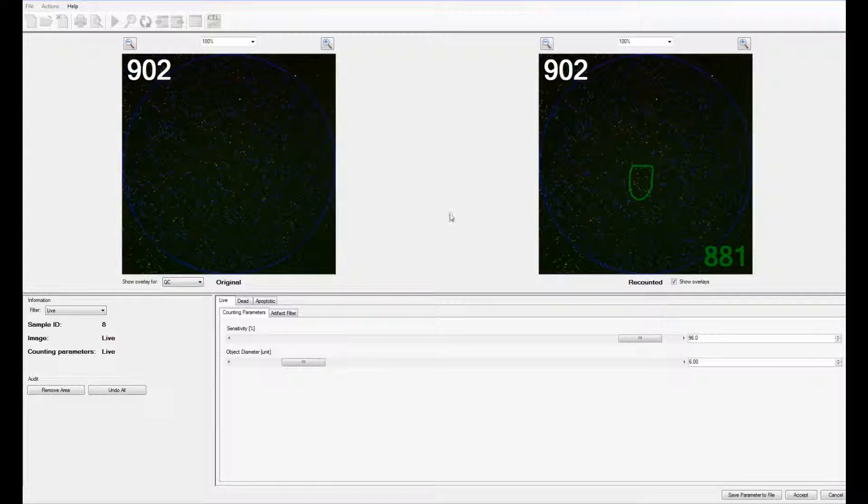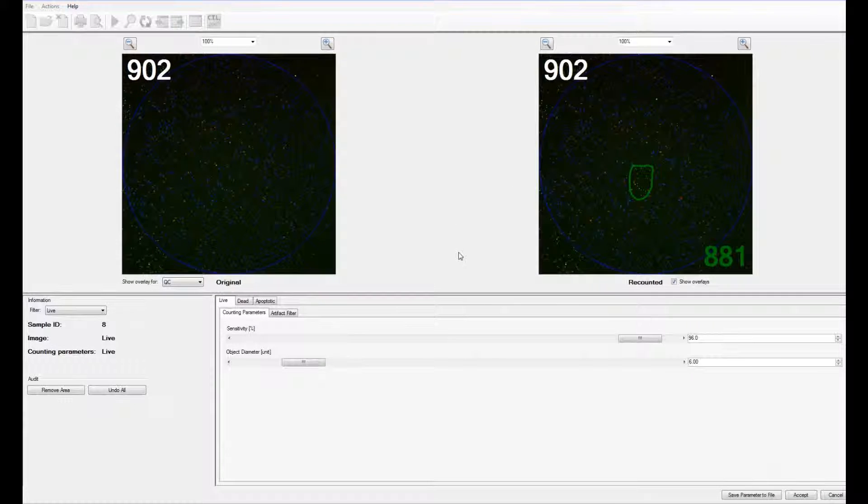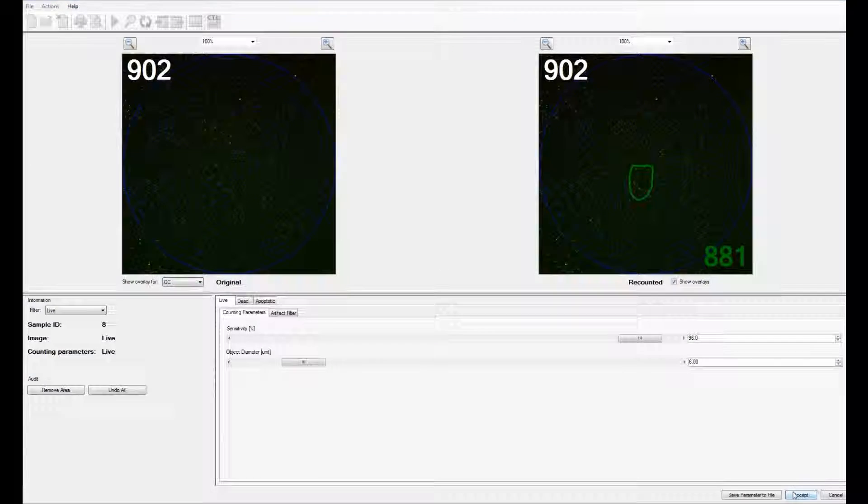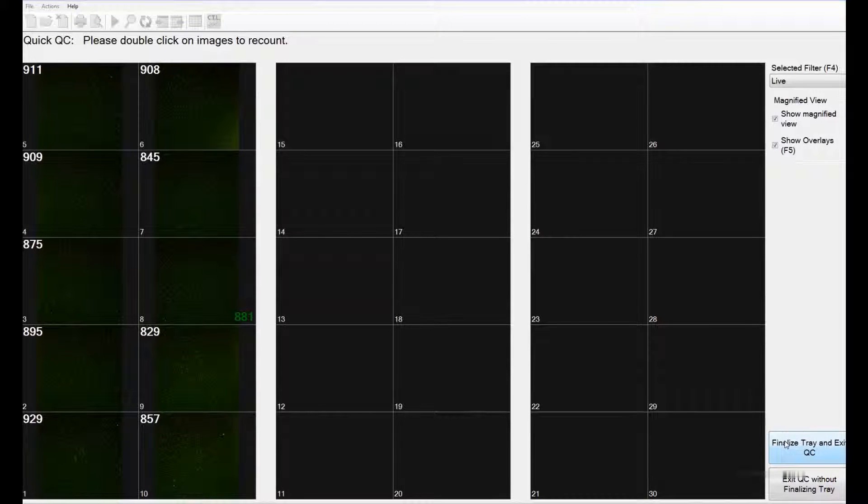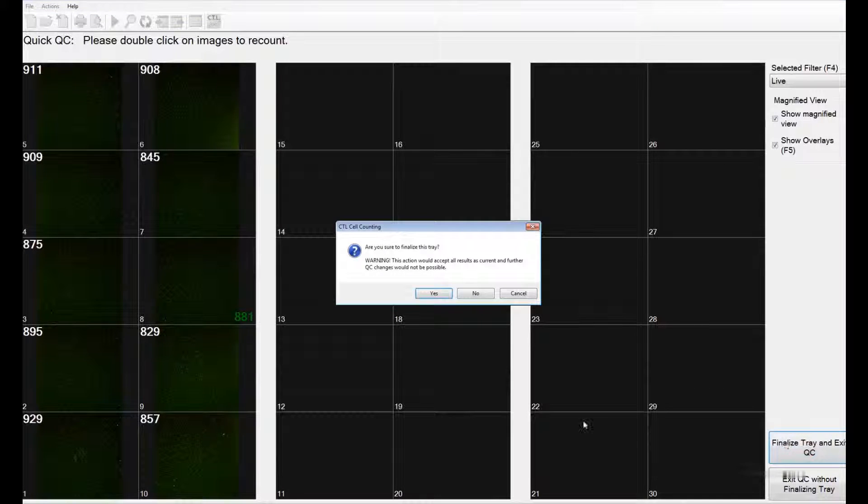It removes a similar area from the live, dead, and the apoptotic images. Once you are satisfied, you can click on the Accept icon. You can also finalize the entire set of images.